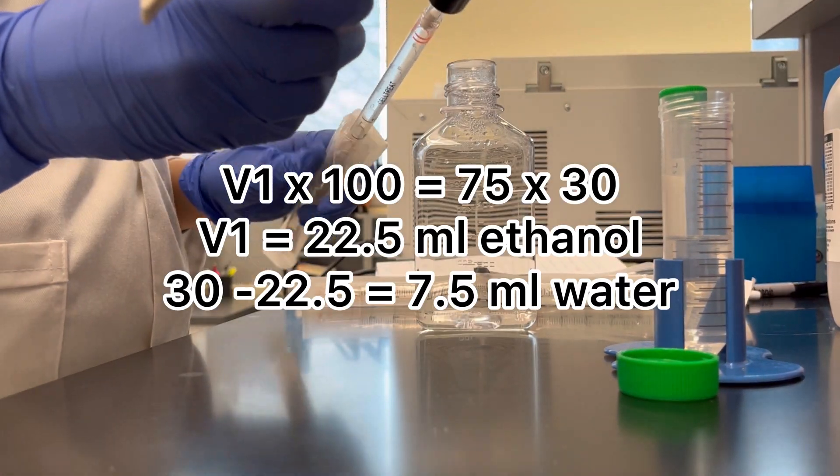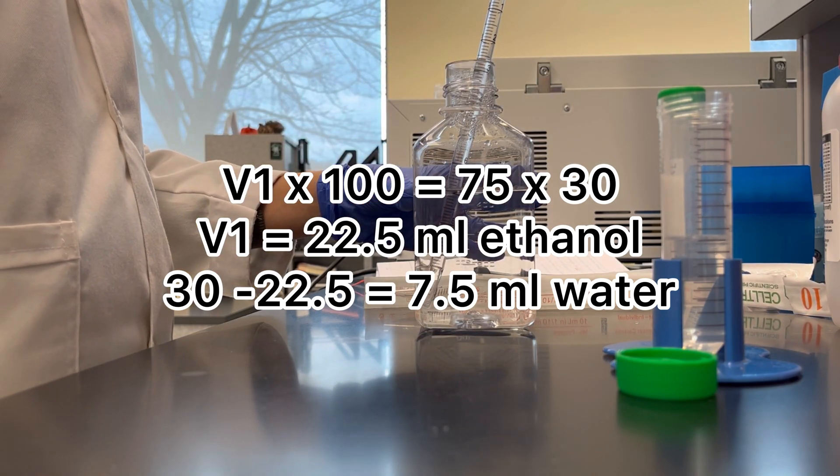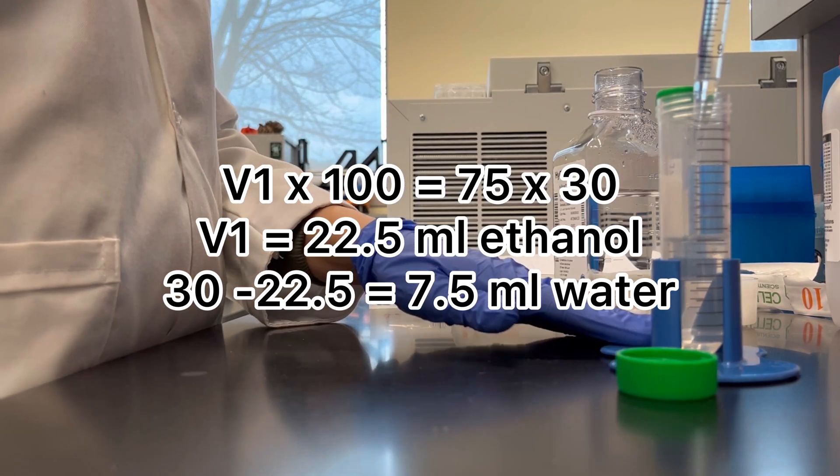Here I am making 30 ml of 75% ethanol from pure ethanol.